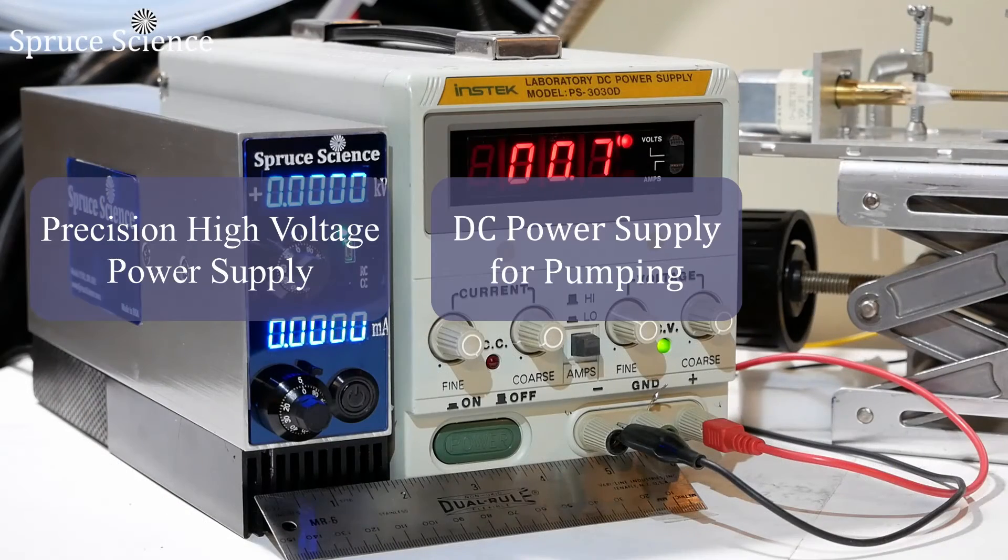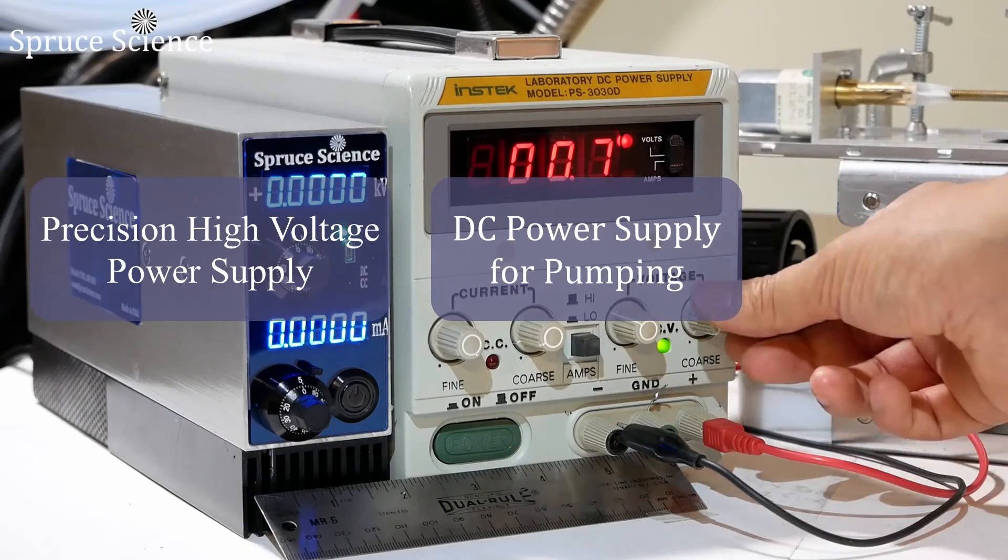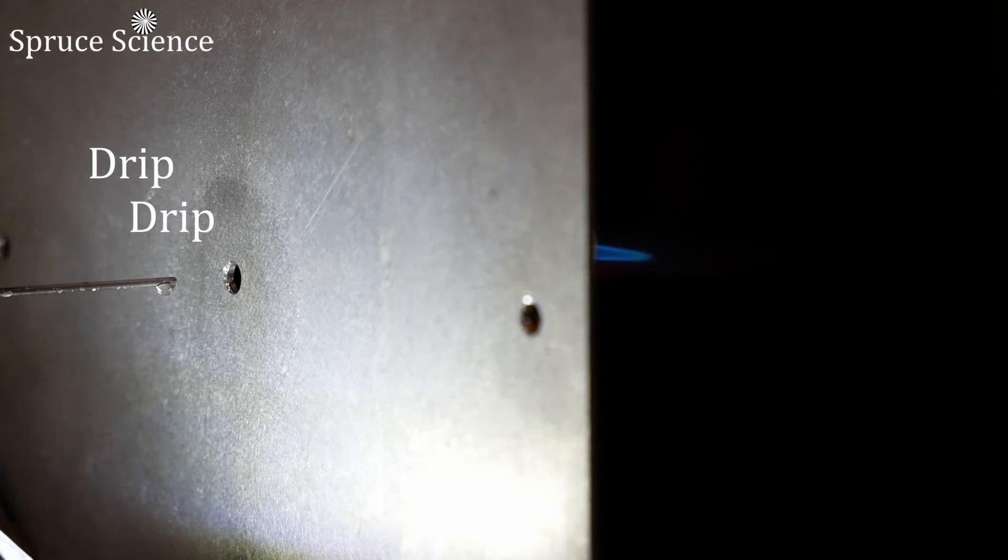High voltage power supply is currently off, so if you look at the tip of the needle, you will see droplets forming then dripping continuously. The sample in this demonstration is sodium dissolved in water and isopropyl alcohol solution.